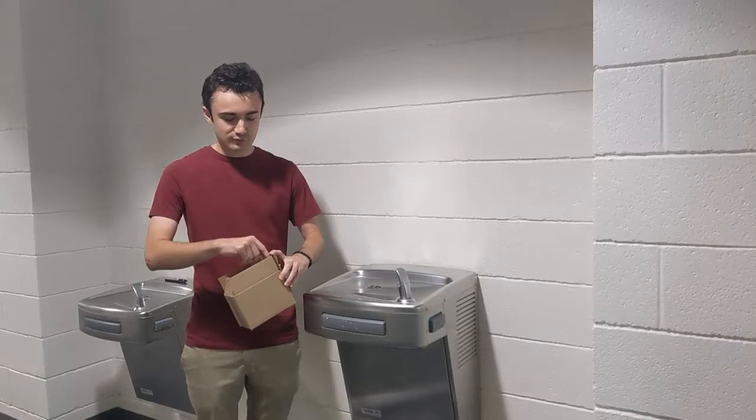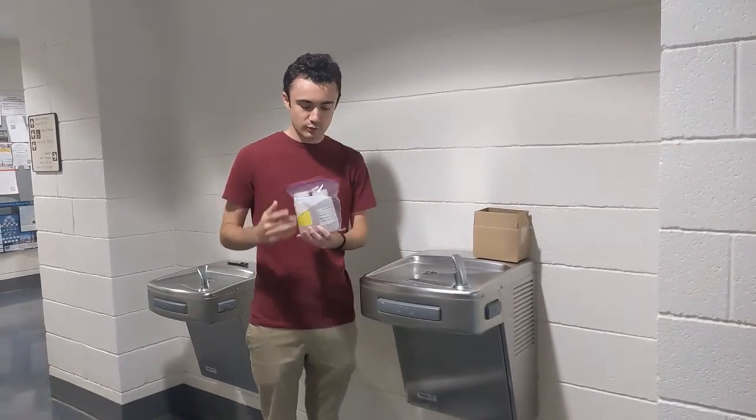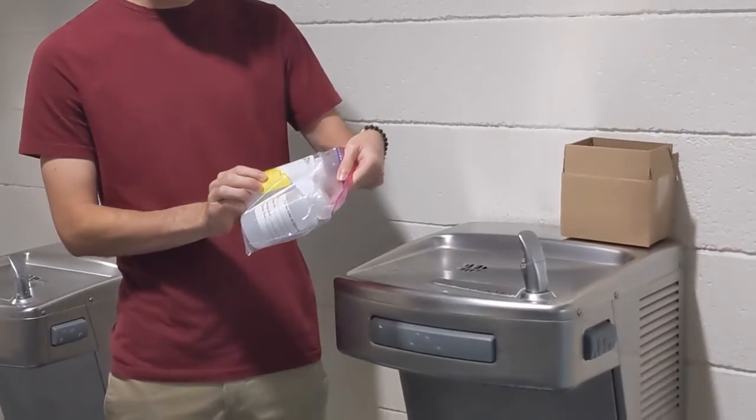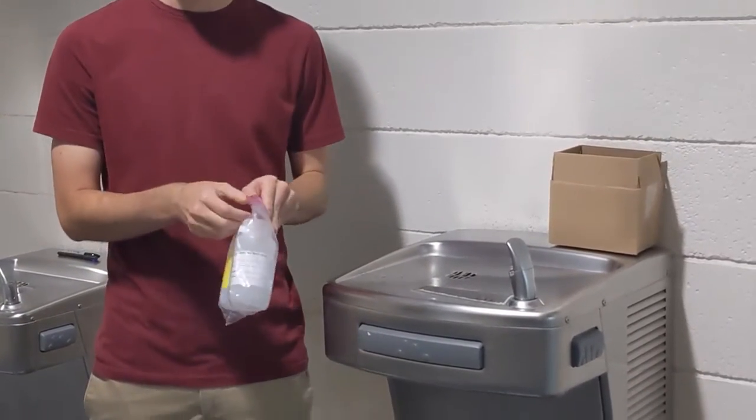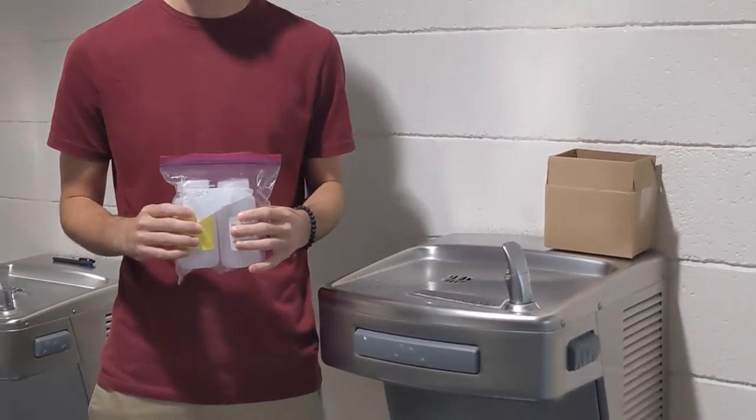Also within the box, you'll find two bottles, one with the yellow label and one with the white label. The yellow label is for the initial draw sample, and the white label is for the flushed sample after 30 seconds.